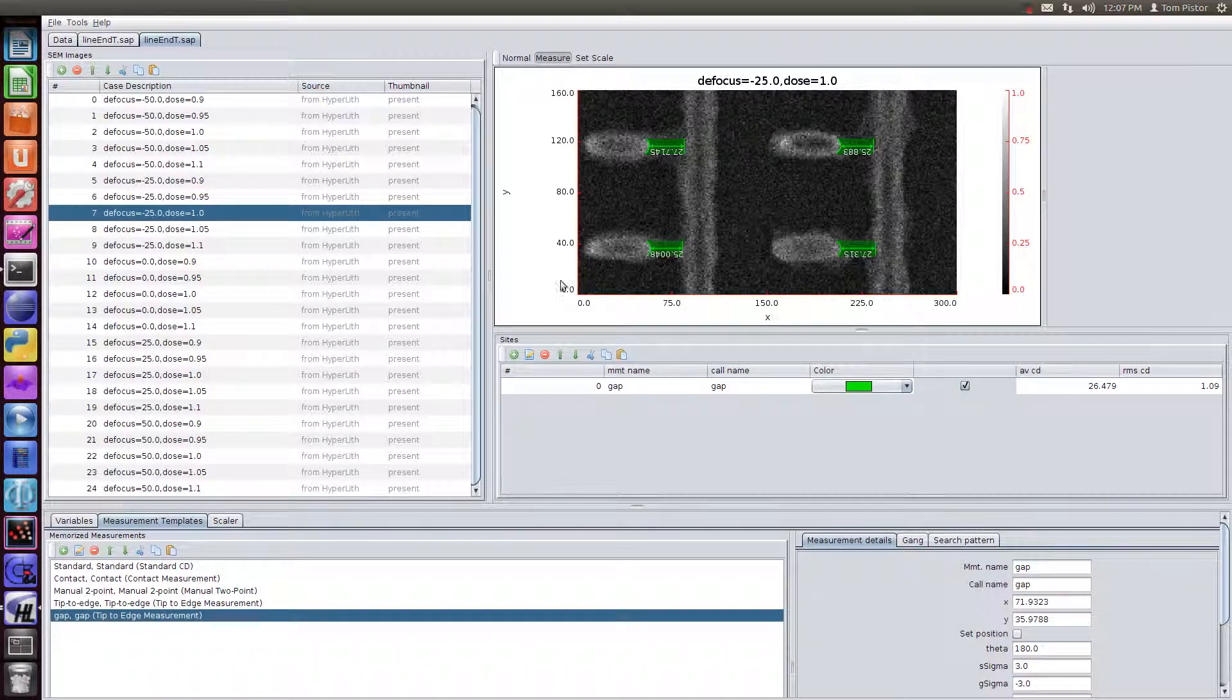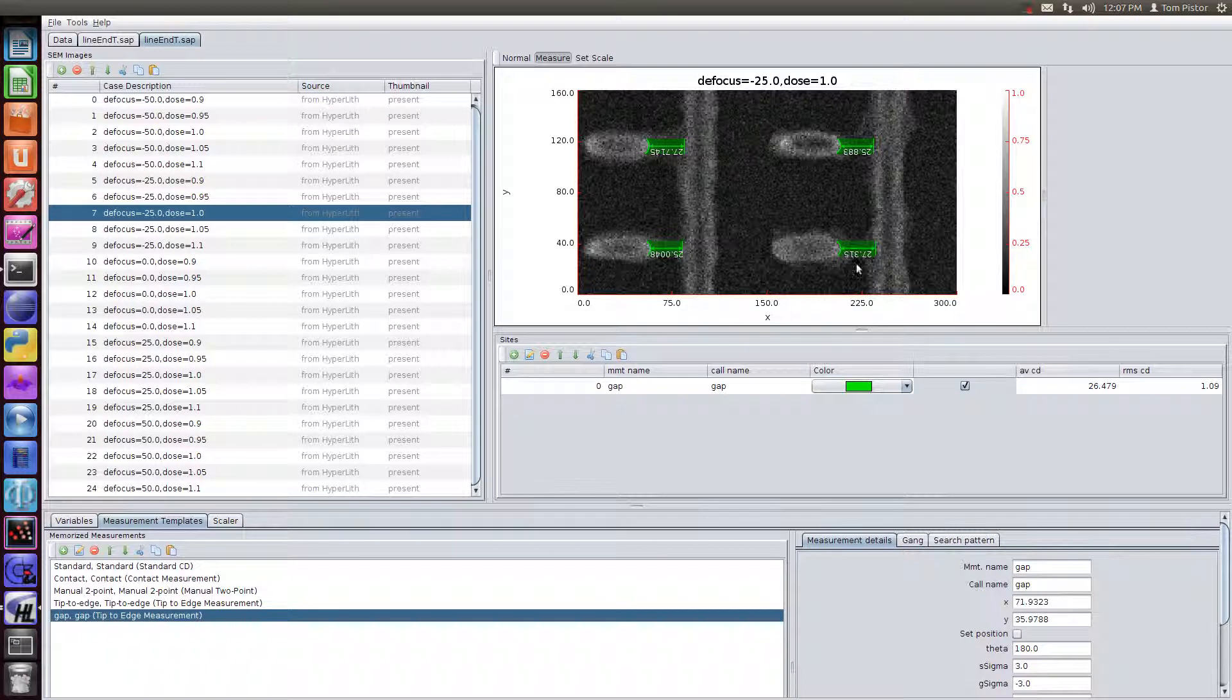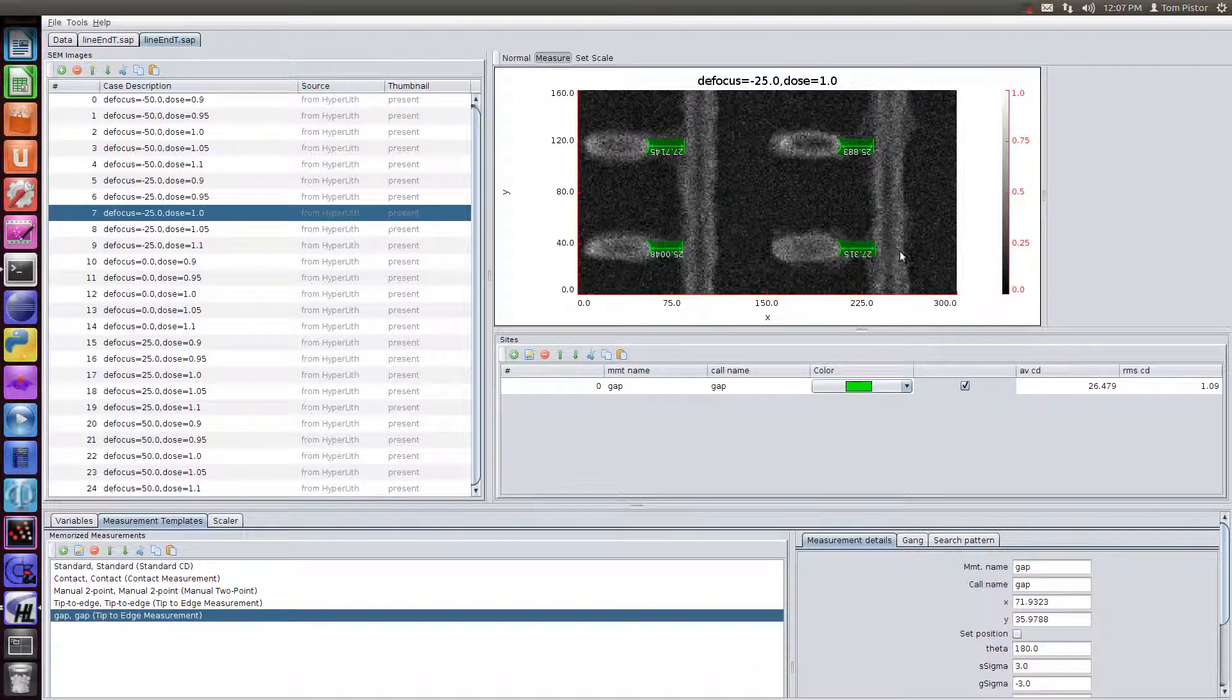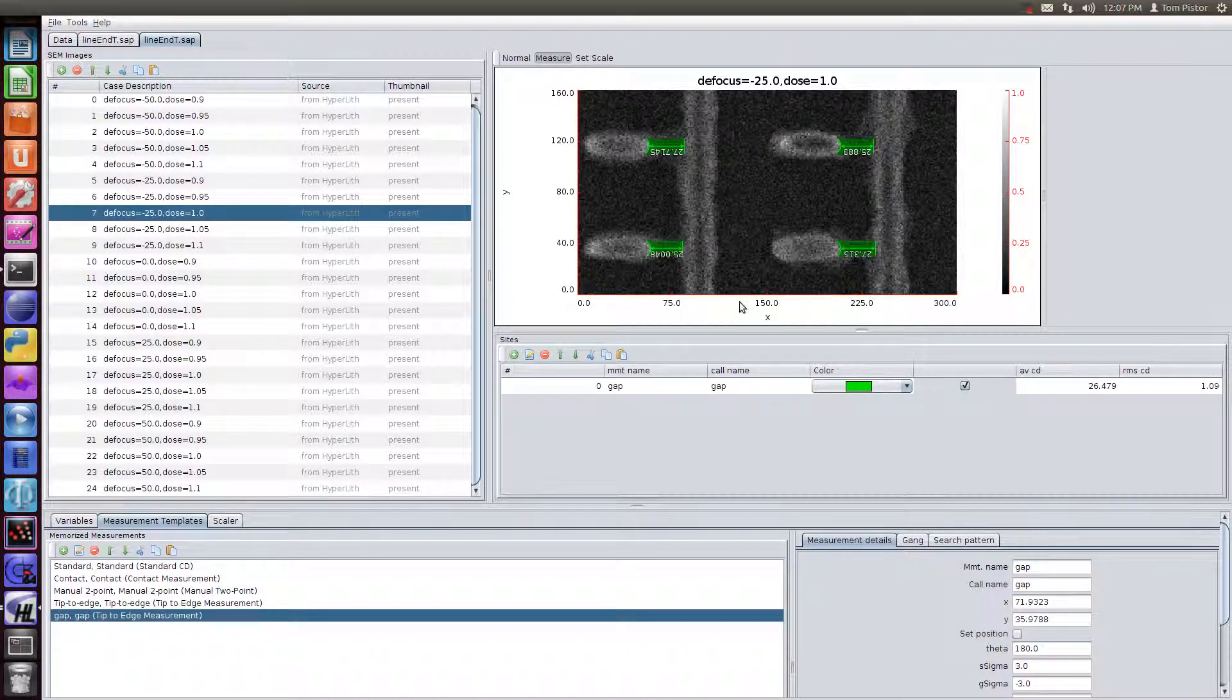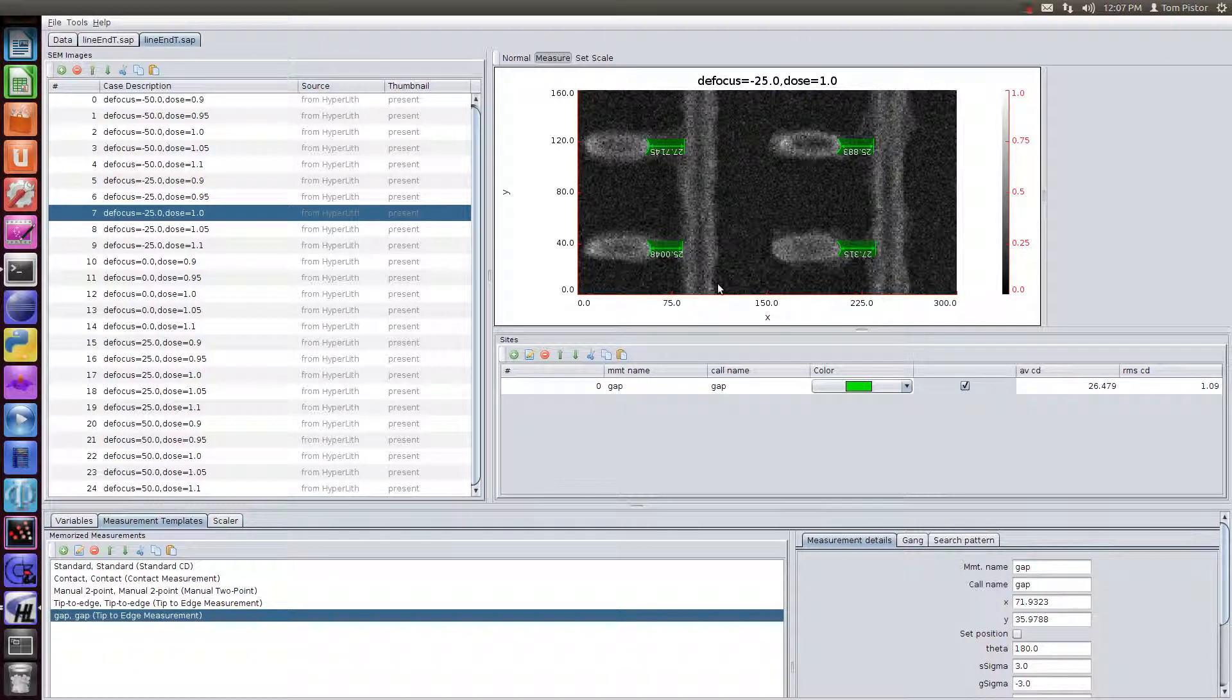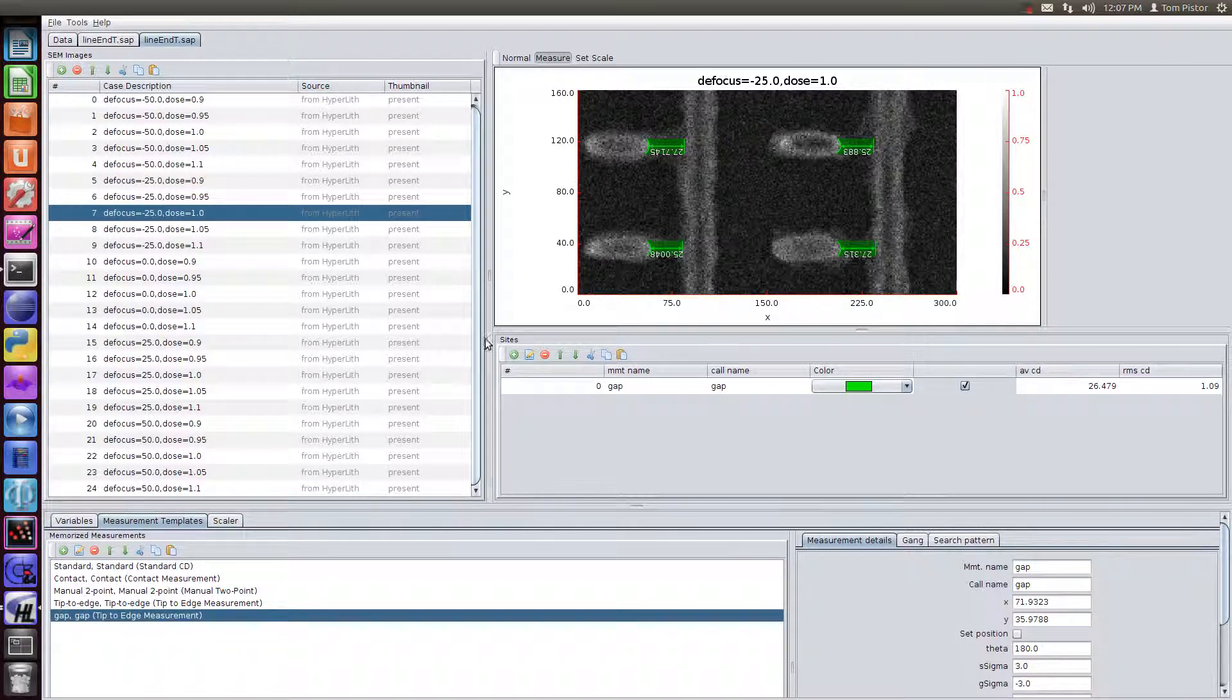So that's not important right now. I want to talk more about the SEM image analyzer. So we can also have multiple measurements on the same set of SEM images. We could be measuring the line width. We could be measuring the line width in several places, the roughness on the lines. And all of this can be saved into a project.